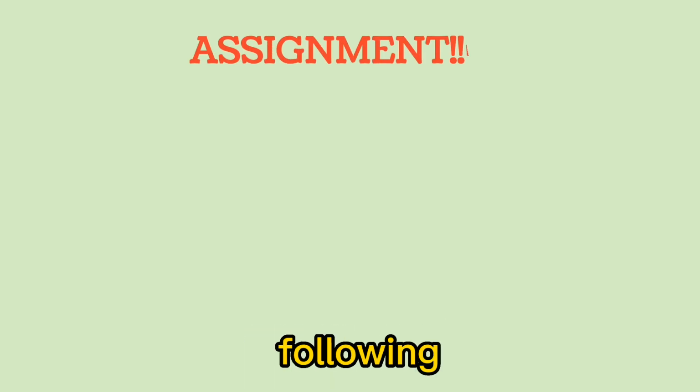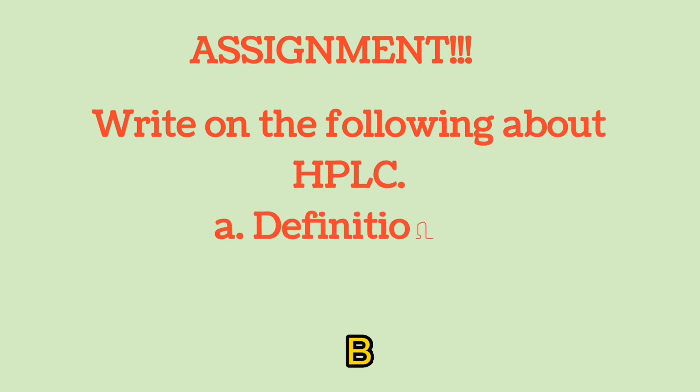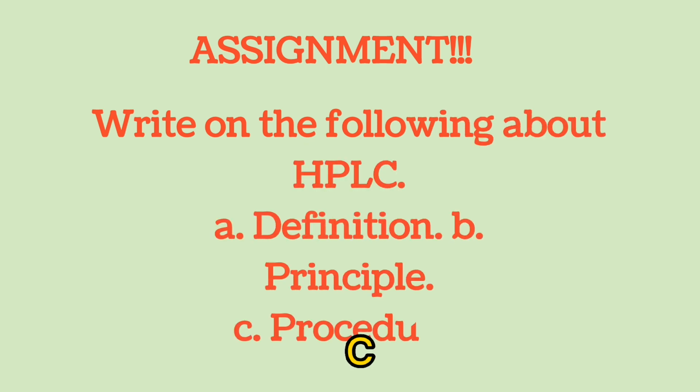Assignment. Write on the following about HPLC. A. Definition. B. Principle. C. Procedure.